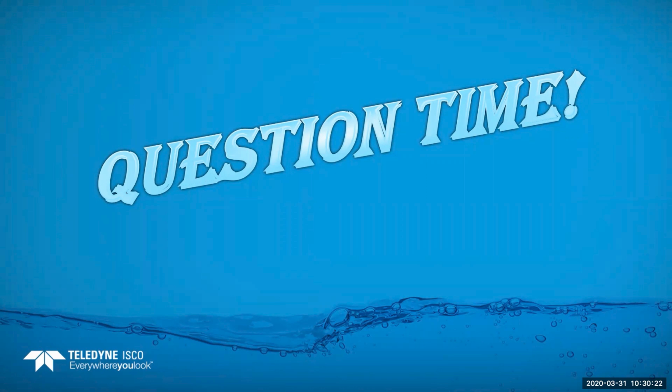So you'd probably just have to get different types of suction line and stuff like that. Changing your pump tubing, you'd have to do that a lot more as well, because you don't want to promote bacteria growth in there. But yes, some people do sample for that kind of stuff. It's just probably a little bit more maintenance.